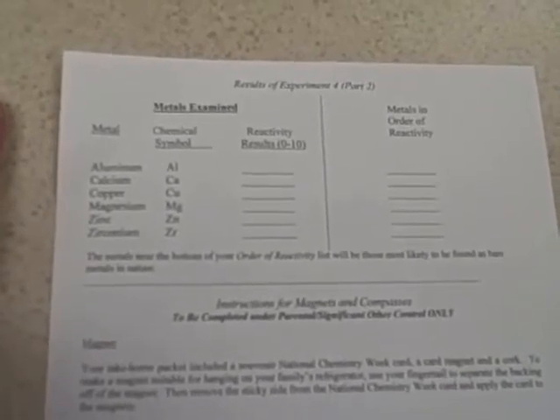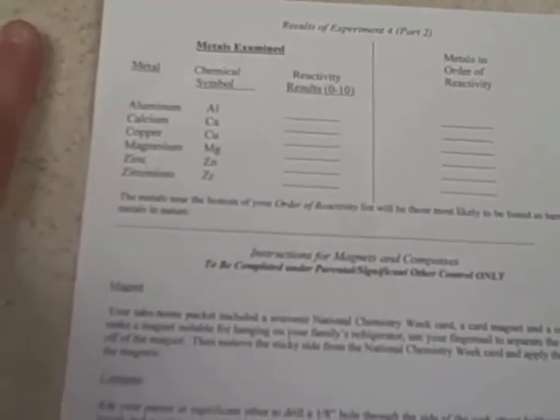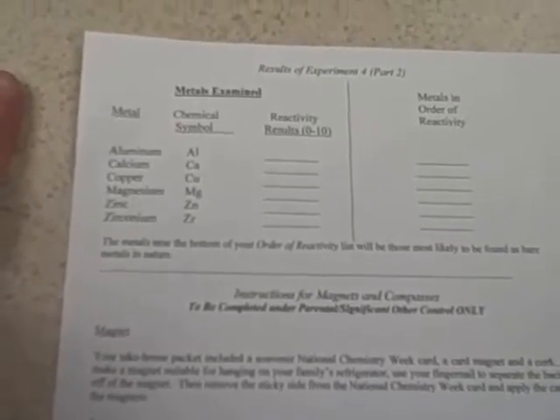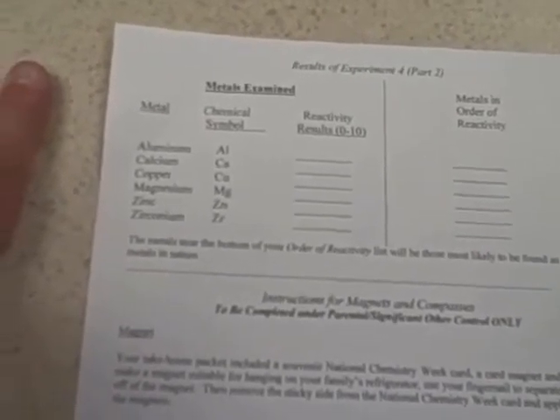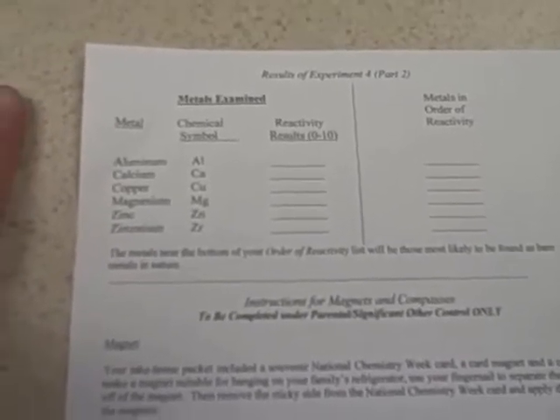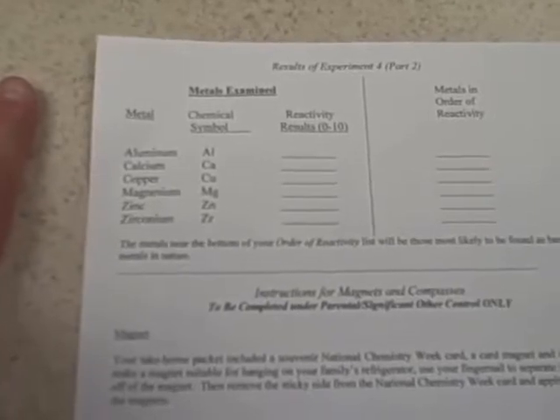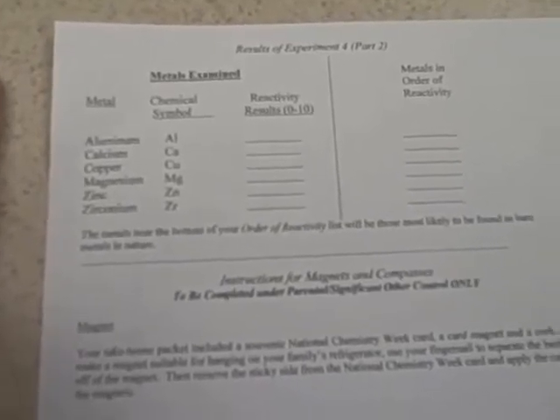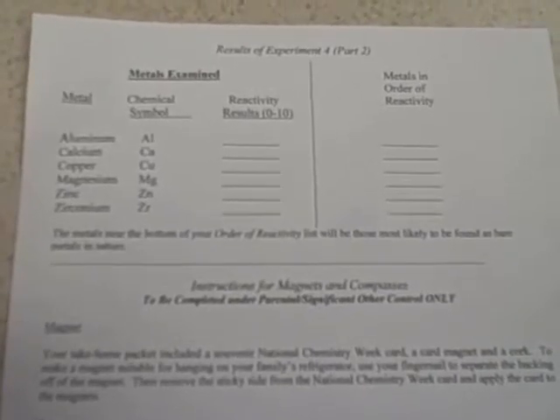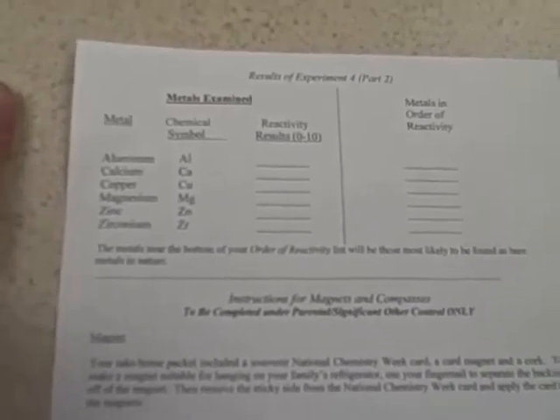Anybody? Did you get any reaction at all from aluminum? Well, you guys have got the answers, of course. Cheaters. You're supposed to be using the back of the word puzzle form, okay? Trust me, the kids won't have the script. We hope. All right. So, realistically, what did you see with aluminum? Not much. Should be about a 0. Not much reaction at all.